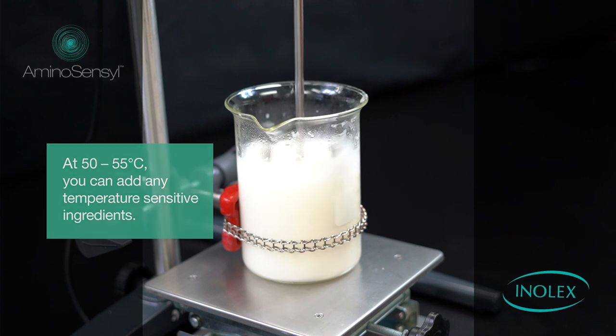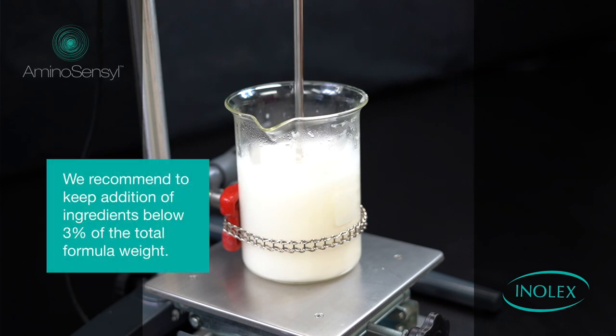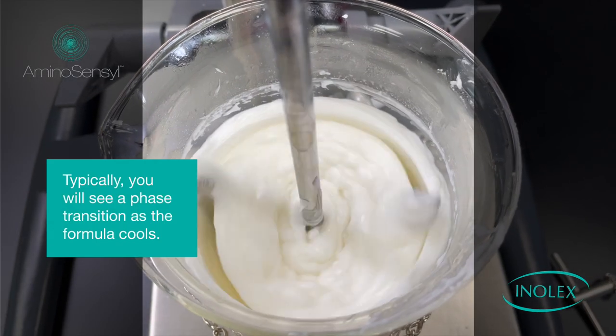At 50 to 55 degrees Celsius, you can add any temperature-sensitive ingredients. Take care to limit the amount of ingredients added during cooldown, as this can affect viscosity and high-temperature stability. We recommend keeping the addition of ingredients below three percent of the total formula weight.